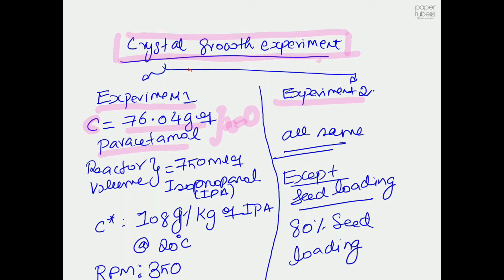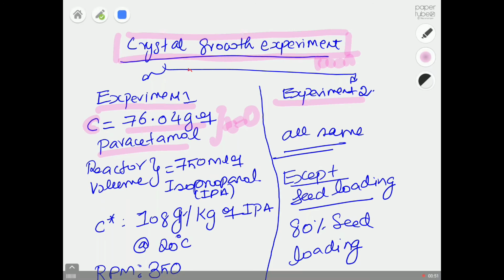And I used a reactor of 1 liter, or 1000 milliliters, but my reactor volume is only 750 milliliters.